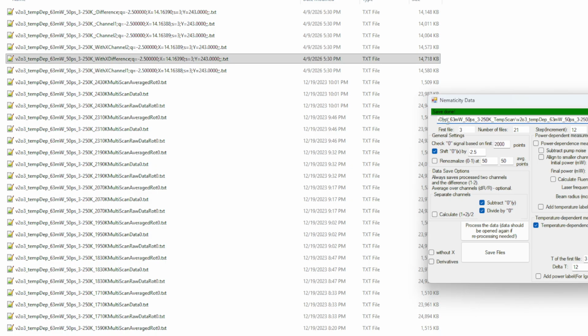The top of the program consists of the place where you have the input file name. You need to input the path to the file name up to the counter. The counter is the number that defines either which temperature or which power it is. Usually when it's temperature, it's in the middle of the file. If it's power, it's at the very end of the file.